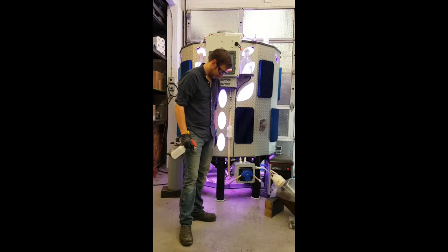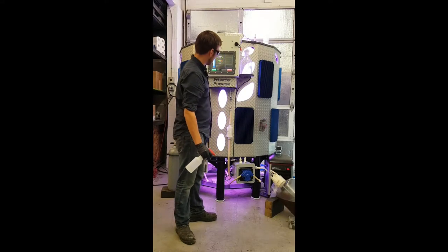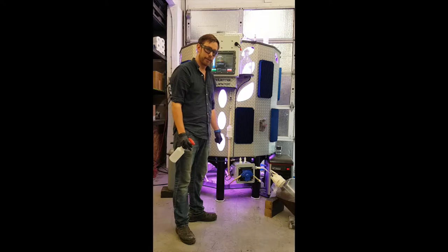Welcome to Industrial Plankton. I'm here to show you how easy it is to inoculate the PBR1250L.